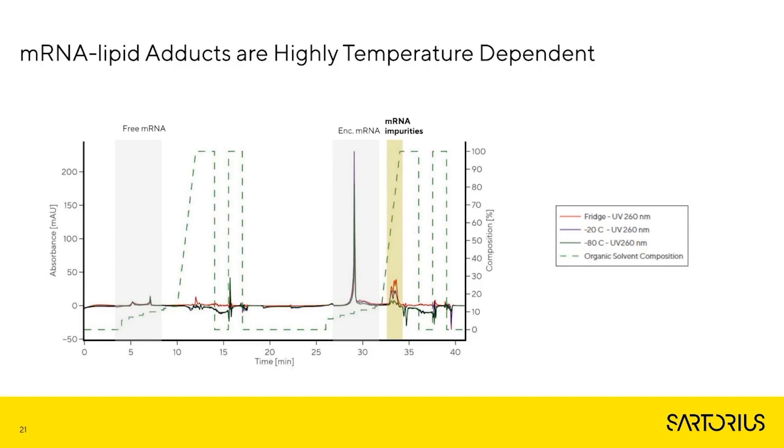And this is very important for stability studies, because generally the trend would be to have some sort of fridge-stable LNPs. But here you see that as we increase the temperature, we're increasing this percentage of adducts.